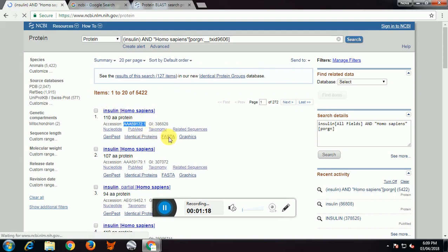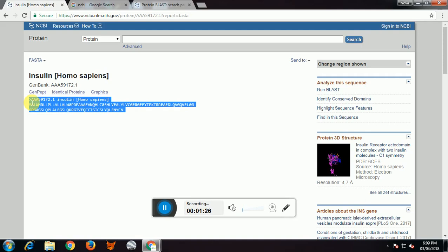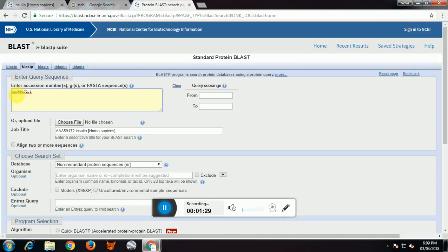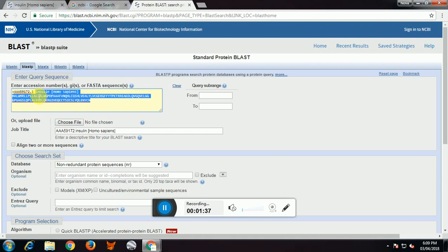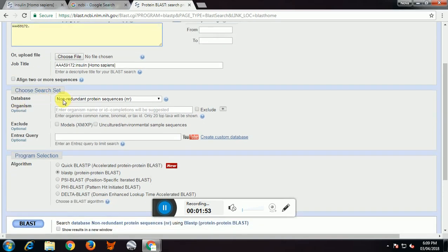This is the webpage of BLAST. We will select protein BLAST because our query sequence is protein. I can type the accession number over here — I have copy-pasted it. Alternatively, you can click on FASTA to get the FASTA sequence and paste that instead of the accession number. I will remove the FASTA sequence and keep the accession number alone.